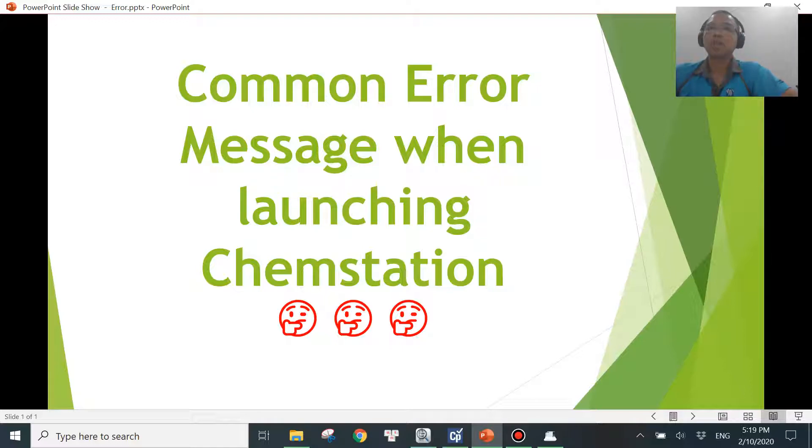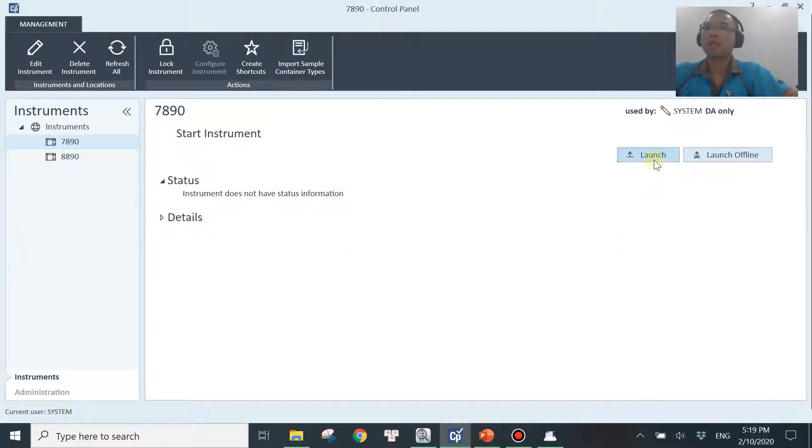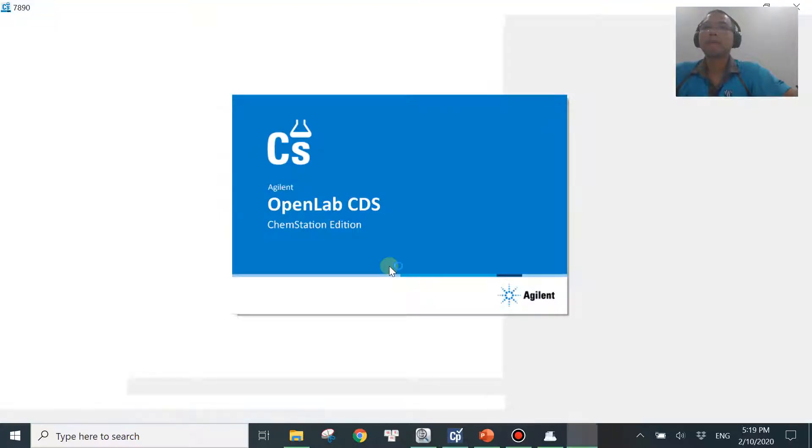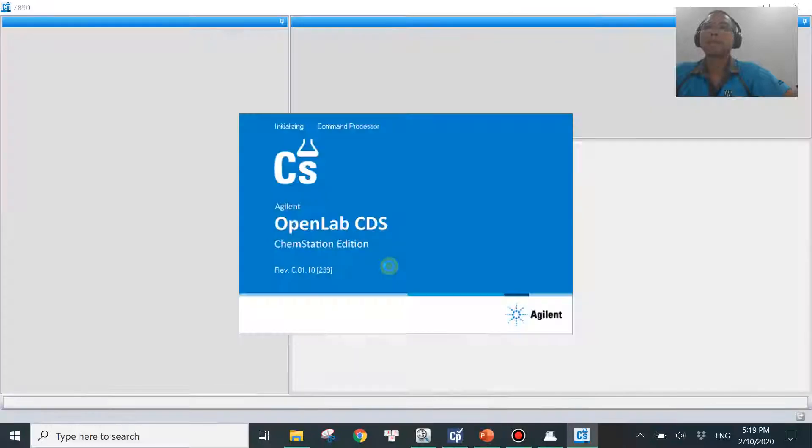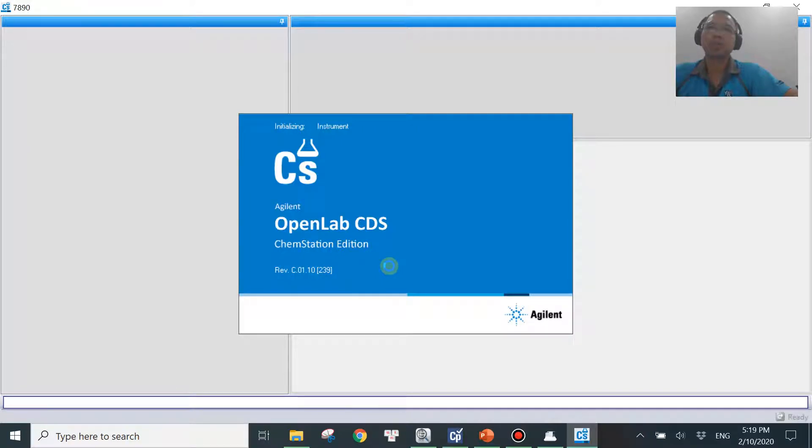So let's get into this error message. Let me first show you the OpenLab Control Panel. And I'm gonna launch my instrument right now. It will take a few seconds to launch your instrument.